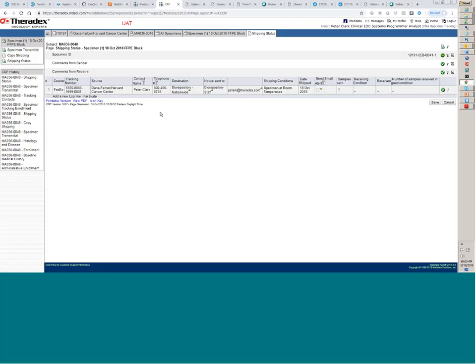And because there's the additional qualifier regarding that confirmation that the biopsy was adequate is not required, not applicable is also a valid answer to the question. Okay, great. Okay, so that is set up that way.